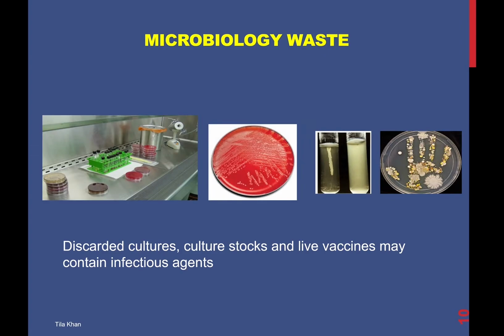Waste coming out from microbiology research may contain infectious agents. These include culture media plates, liquid broth tubes, discarded cultures, culture stocks, and live vaccines.